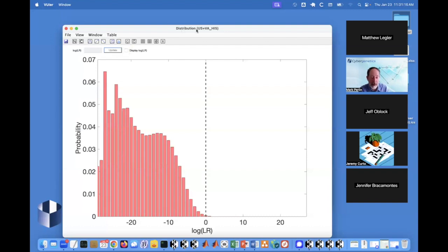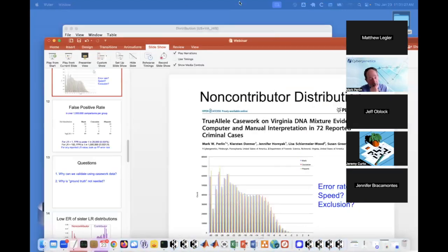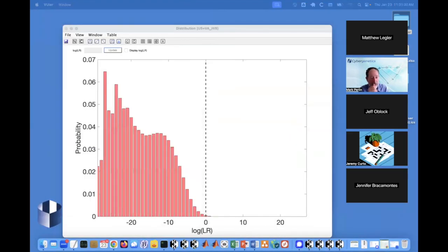What you'll see is that that curve that Matt is showing you is identical to what we published 10 years ago, except instead of taking 3 million comparisons, one million per ethnic group, and then collating all of this stuff, it's instantaneous. As Matt said, he loaded it in, the computer calculated it, the whole thing took about a minute. And it's much more accurate. I mean, this is fine at one band resolution, but if you look at the curve, it's exact.